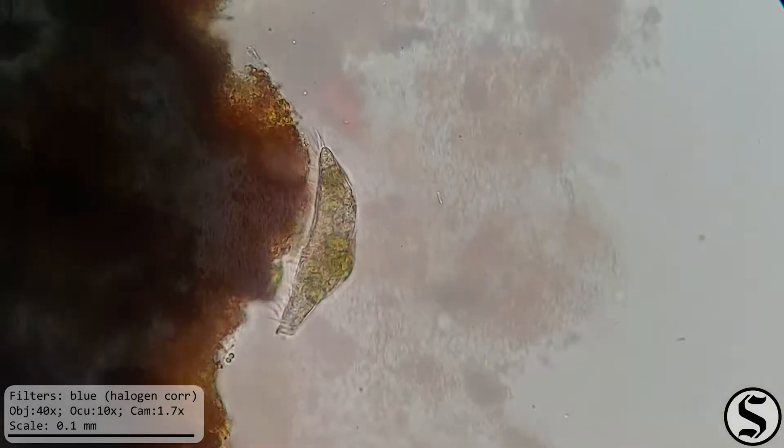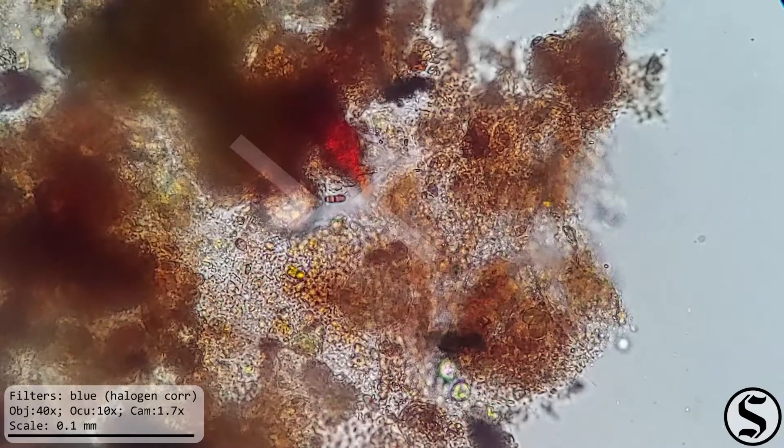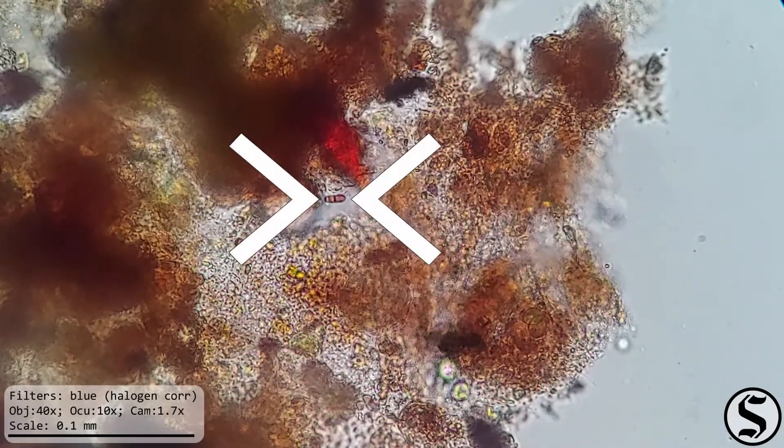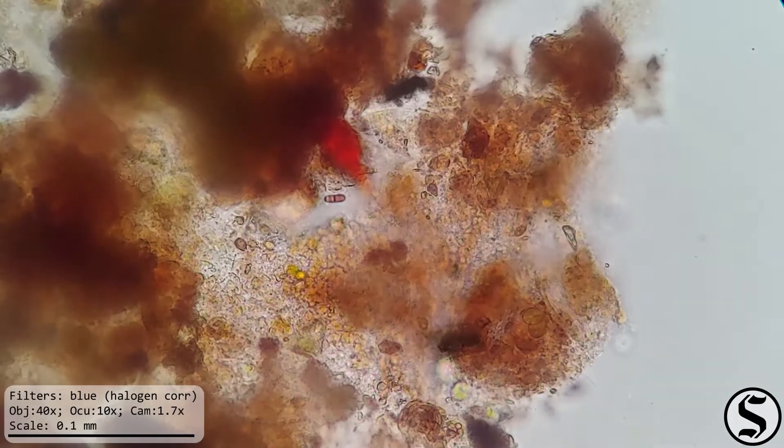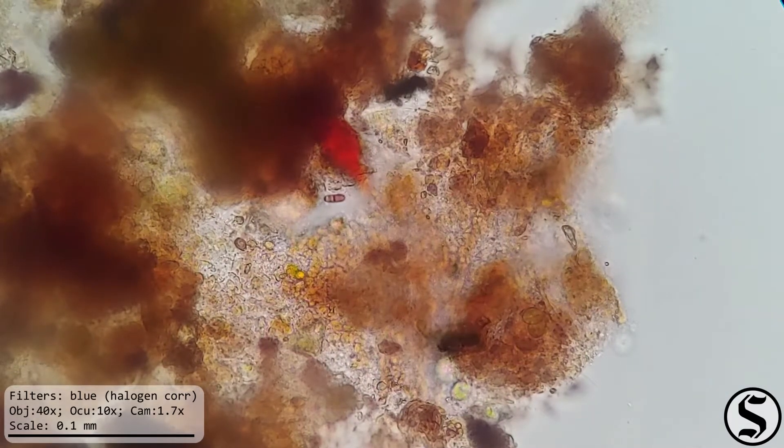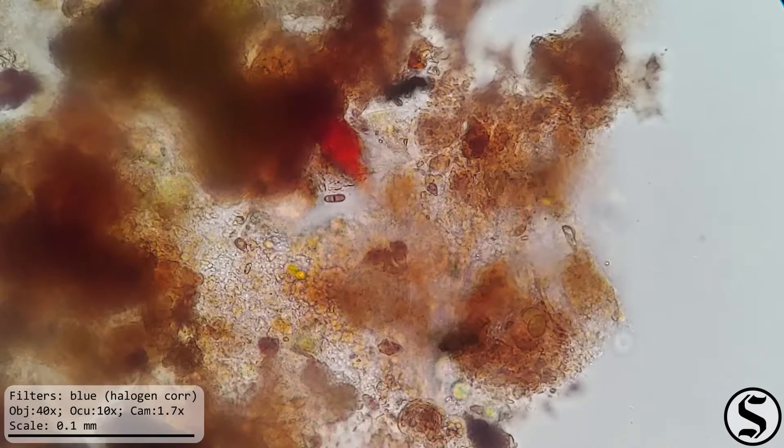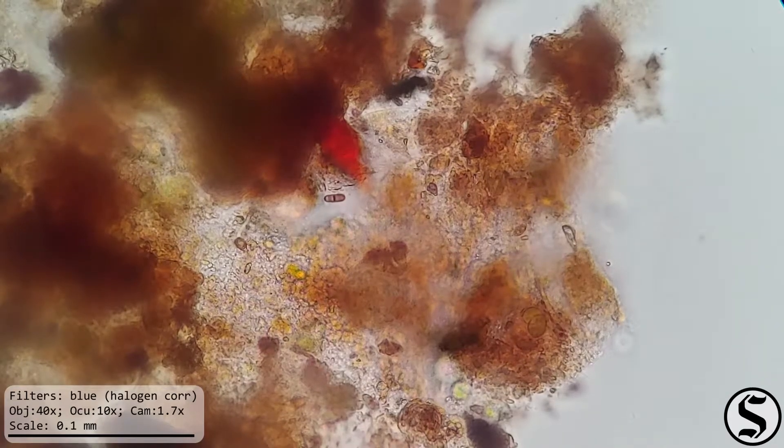Now I'm not really sure what this thing is, but it's too symmetrical and interesting looking I think for it to be inorganic. I'm curious if this is a spore of some kind.